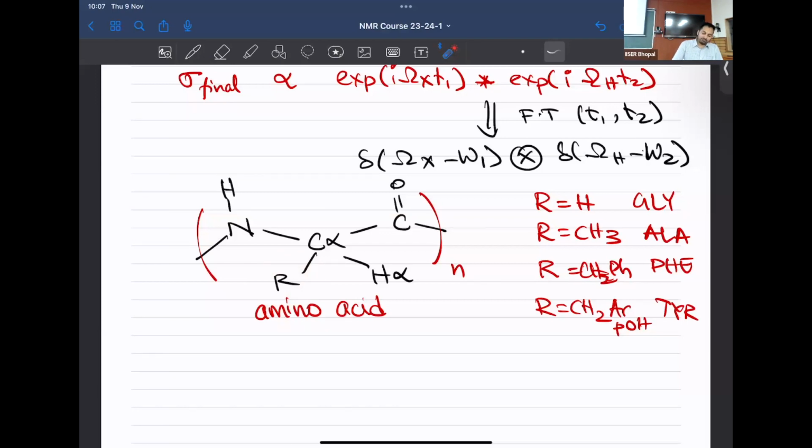The most fortunate aspect that we have here is that we have heteronuclei that are directly bonded to a proton. So in this aspect, we are fortunate enough to start with the nitrogen proton HSQC experiment, which forms the fingerprint for that given protein. 15N-1H HSQC is a fingerprint.